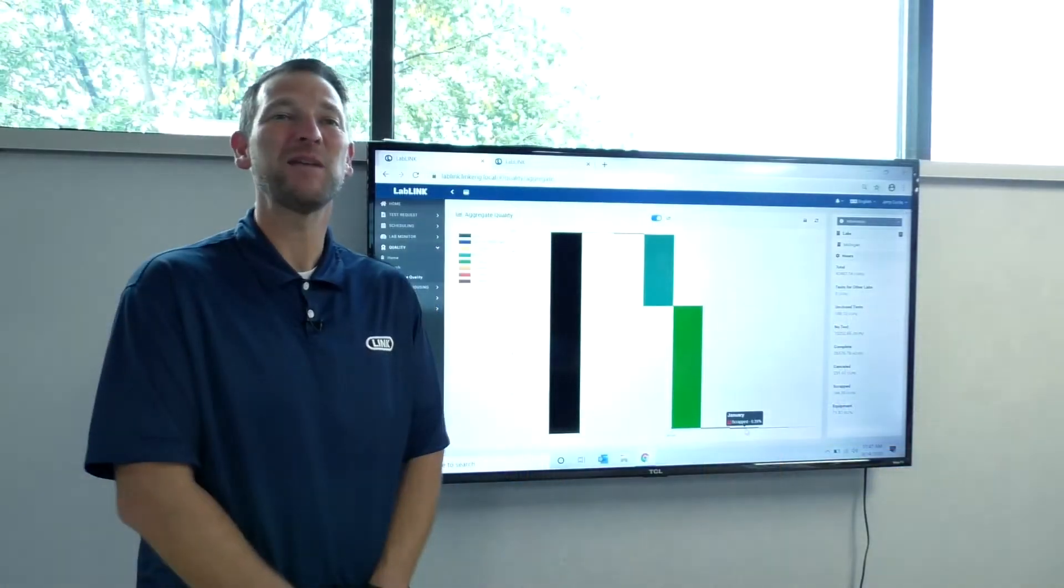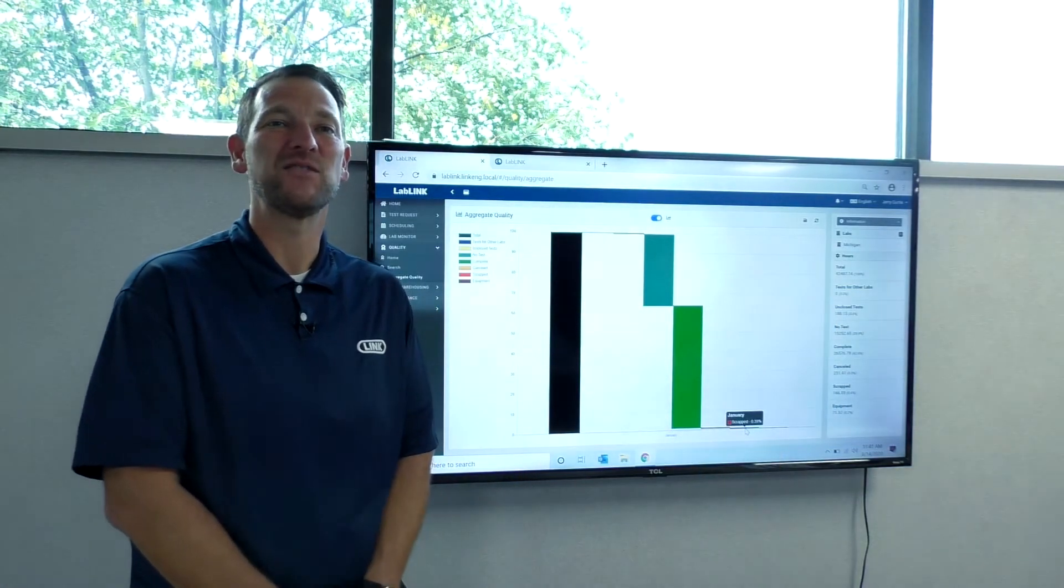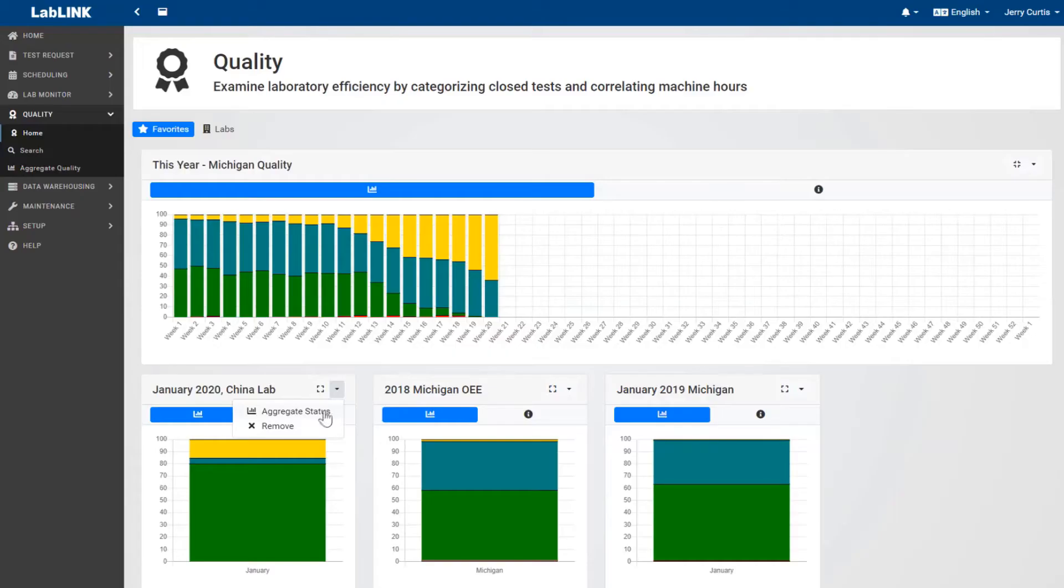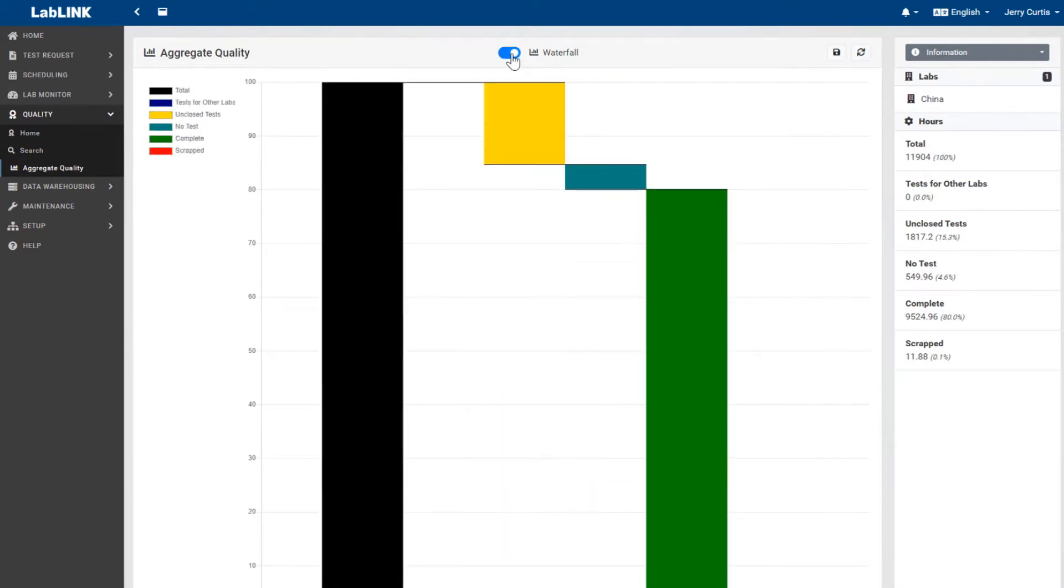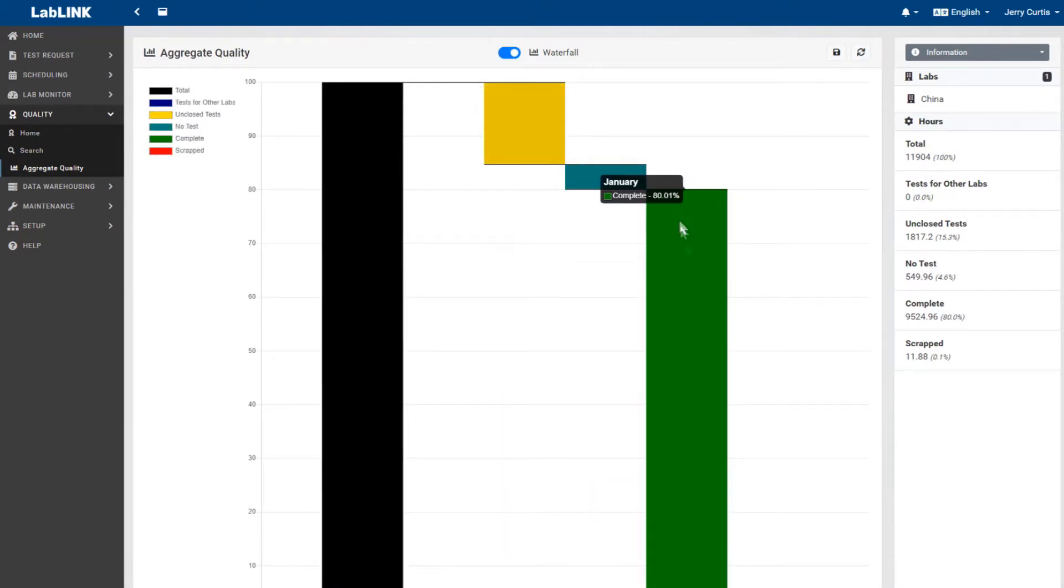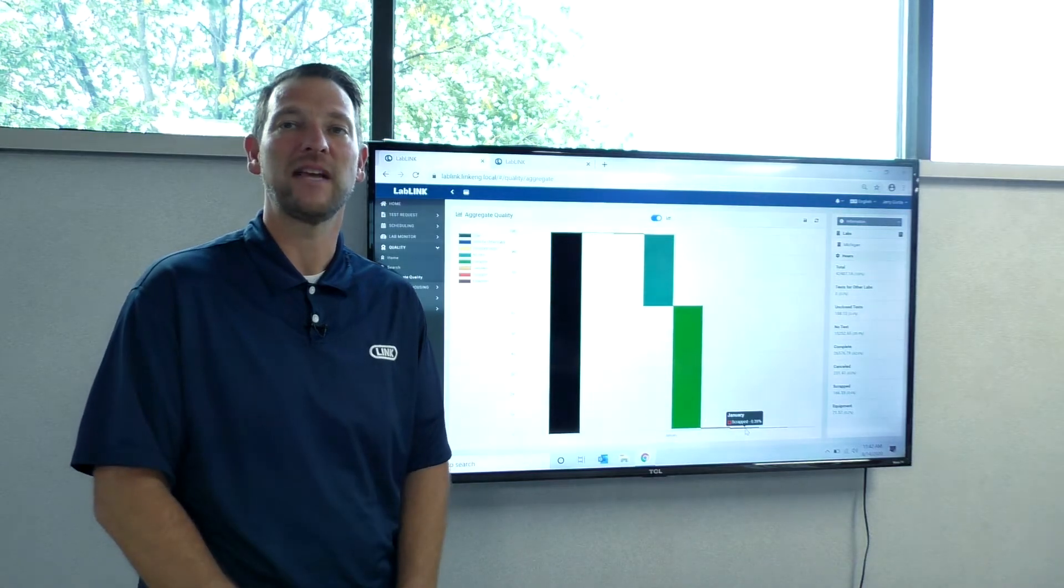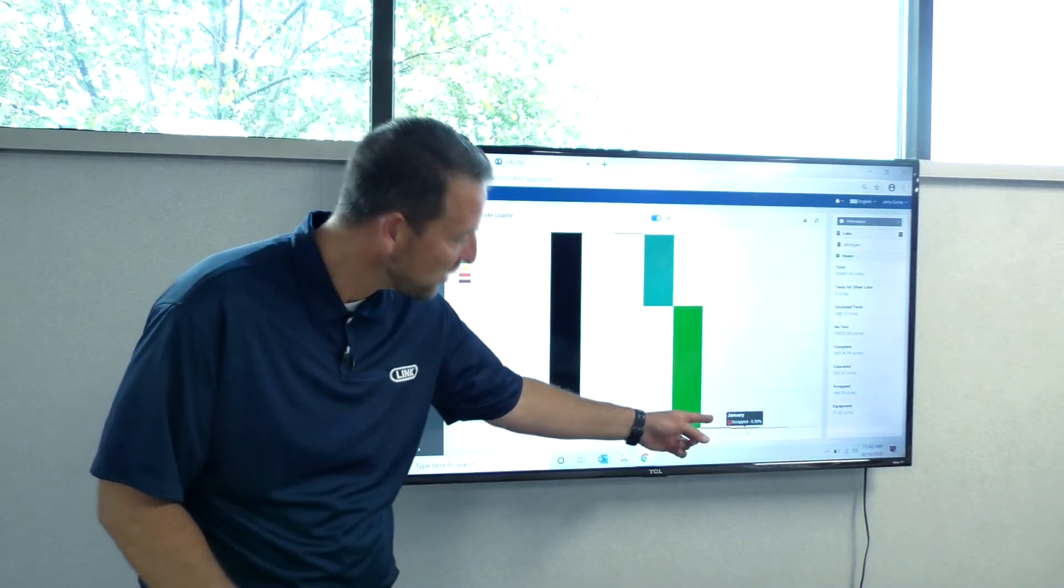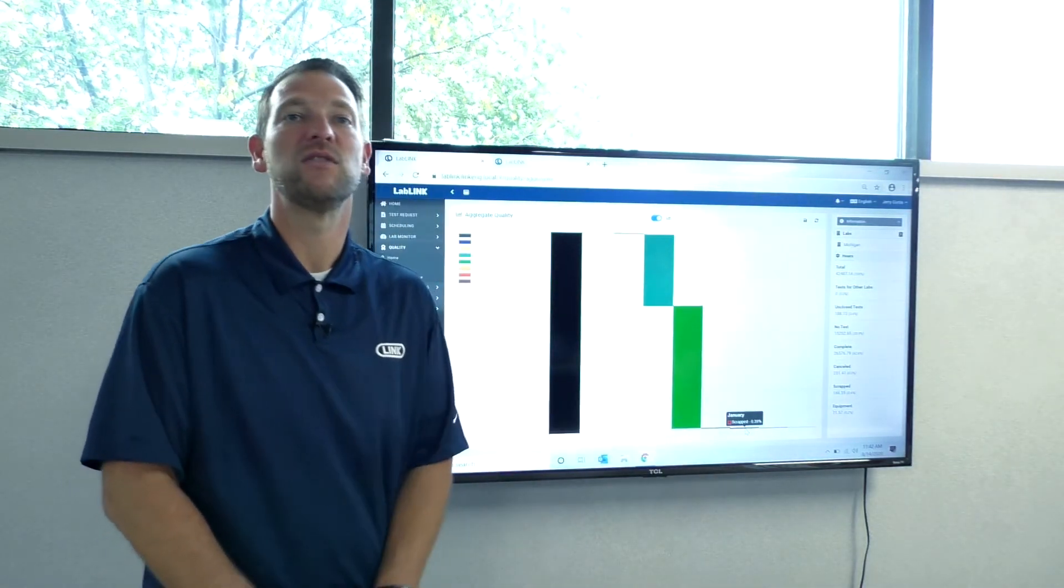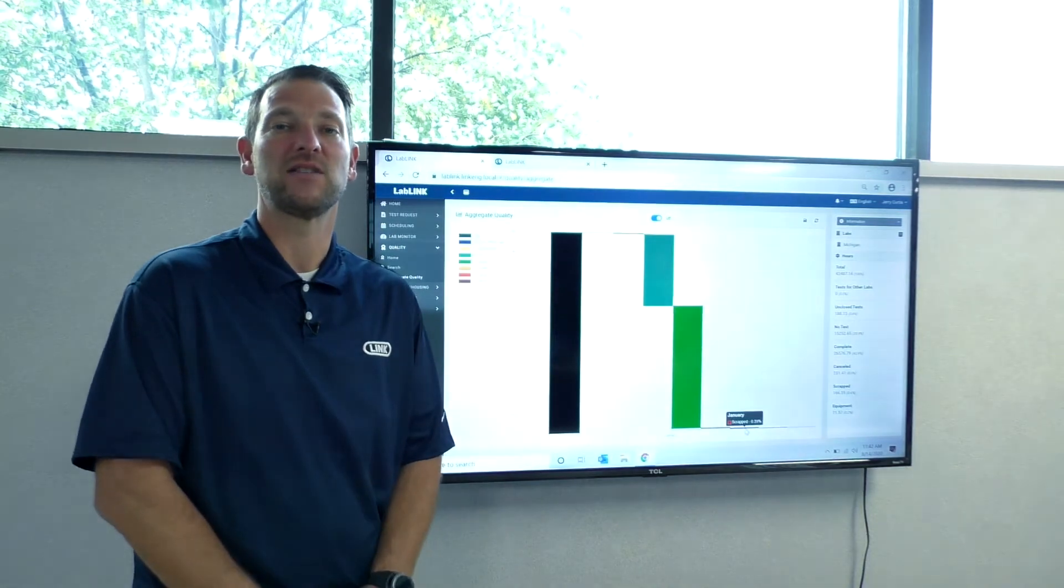The quality module allows users to update completed tests with a quality-related disposition. This provides a reporting tool for tracking undesirable test outcomes and their causes, such as scrapped tests due to various circumstances.